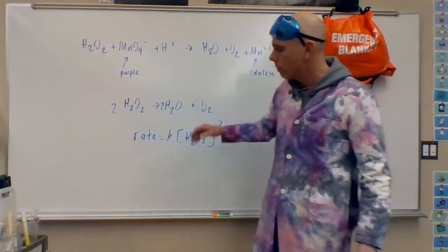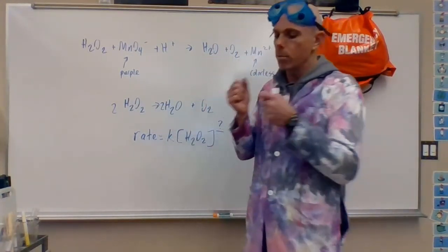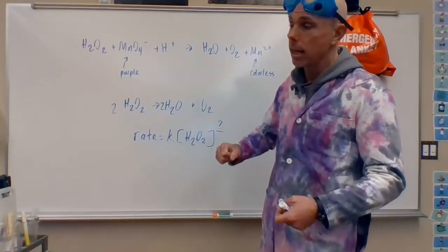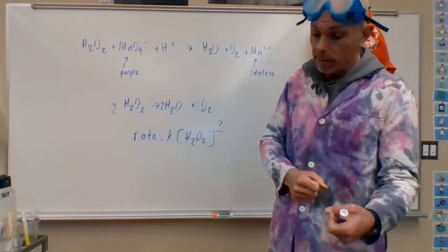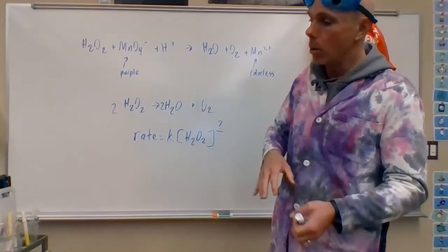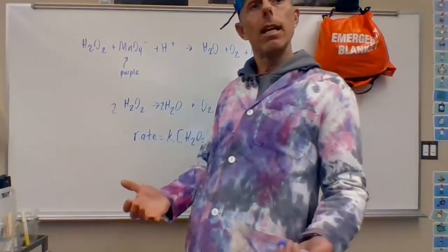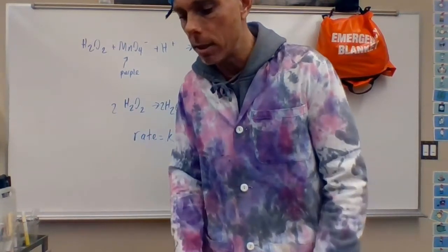We're going to set up a reaction flask where hydrogen peroxide is decomposing, and every 6 or 7 minutes I'll be pulling hydrogen peroxide out, adding permanganate to it, titrating against it to be able to then calculate how many moles of peroxide were in the flask at that moment in time, therefore what the concentration was, such that we can graph the concentration of peroxide against time at 6 various time points. And if that's not linear, we know it's not zero order. If concentration against time isn't linear, we know it's not zero order.